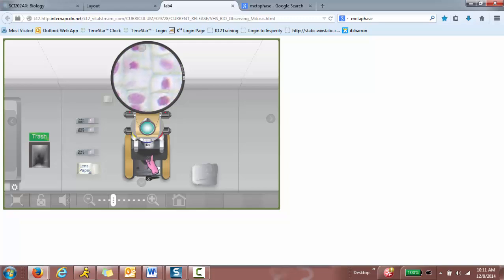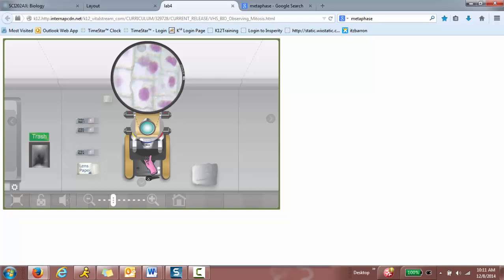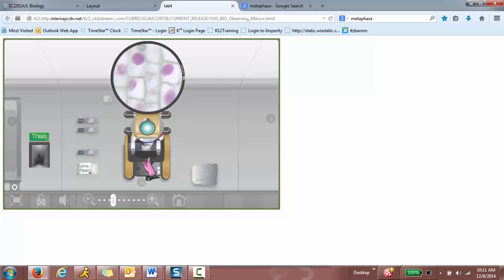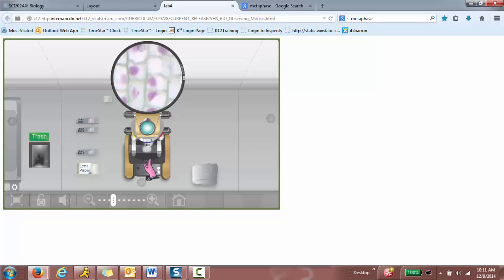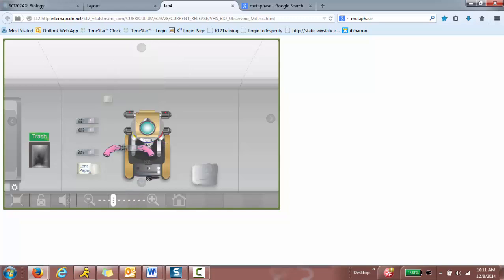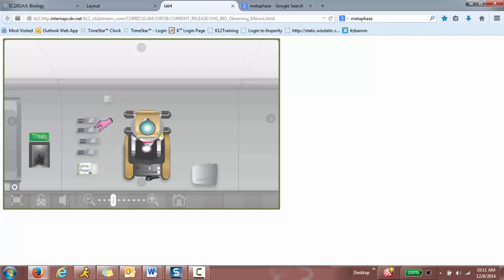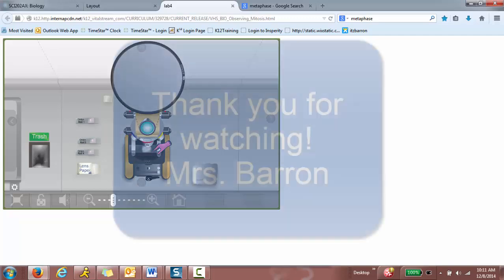And you just move it around and try to find, I'm trying to look for metaphase right now. Each phase. And if you can't find it in this one, well, you take off your slide, go back to the smallest objective lens, which is very important. And get another slide and look for it again.